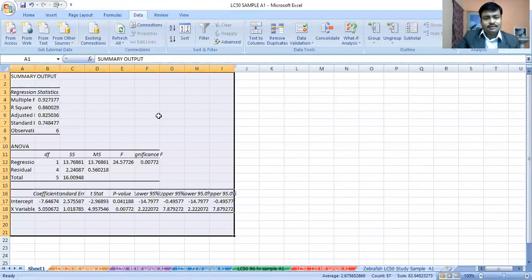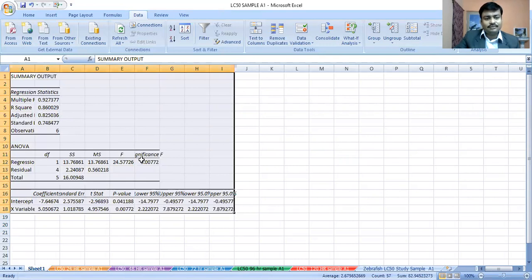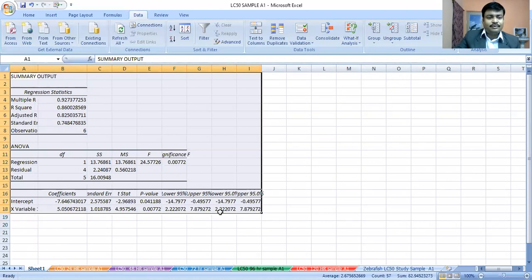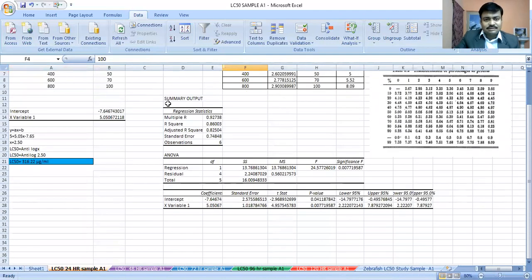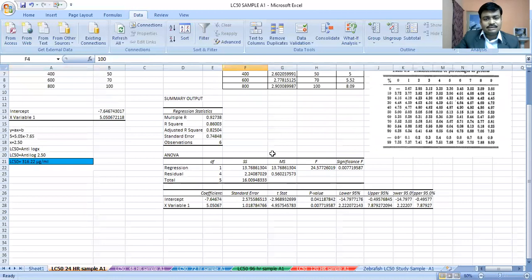From the regression output in Sheet 1, two values are extremely important. The first is the intercept value, which is minus 7.6467, and the second is the X variable coefficient, which is 5.050. I have copied this table into my original slide so you can compare it. The intercept is minus 7.64 and the X variable is 5.05.